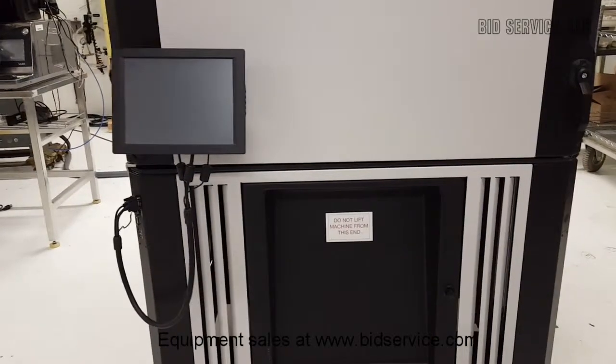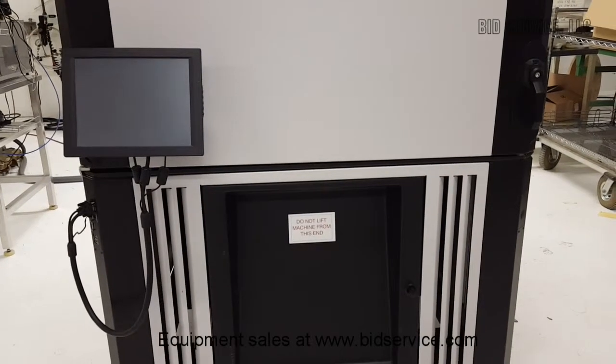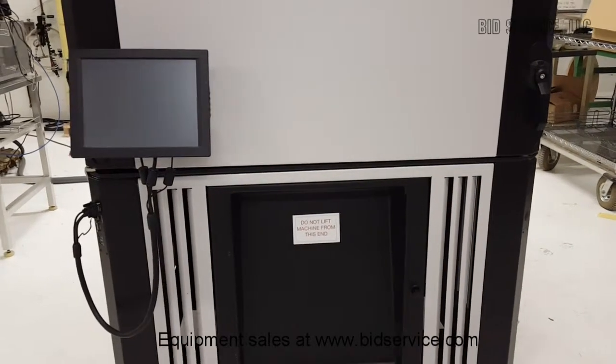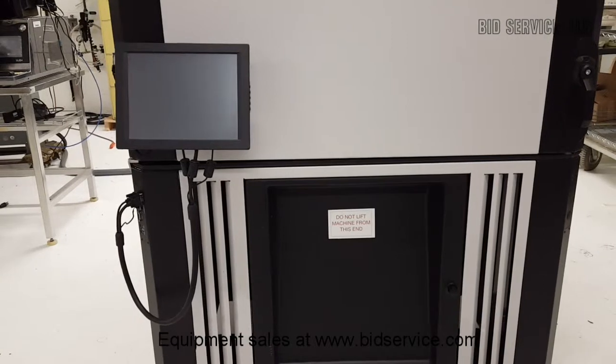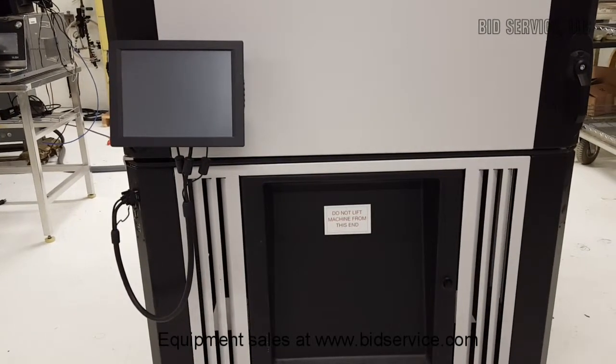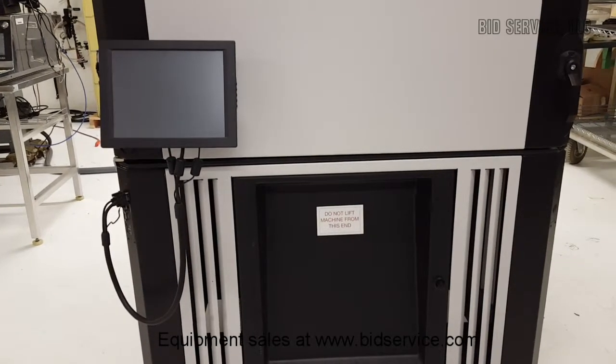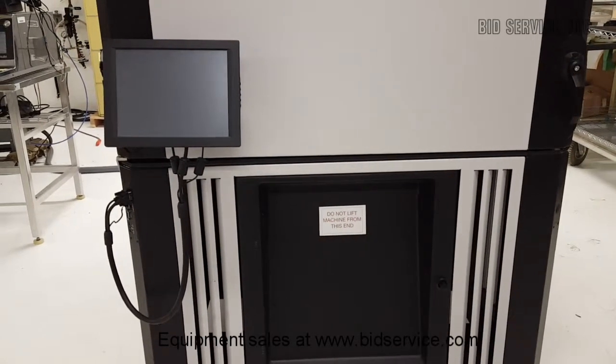This is a demonstration of the Thermotron SC120066, an ultra-low temperature environmental chamber. It is equipped with a digital programmable controller with touchscreen display, USB ports, RS-232 ports, and an Ethernet interface.